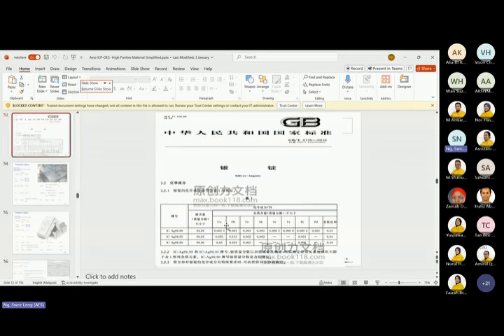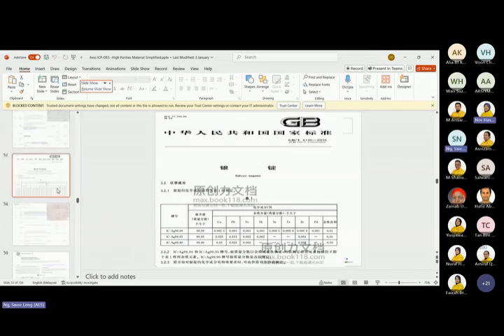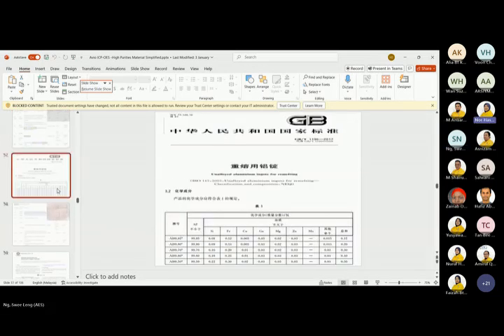So you are running copper, lead, iron, antimony, selenium, tellurium, bismuth, and palladium. The whole world will do the same thing. Everything is tested the same way.